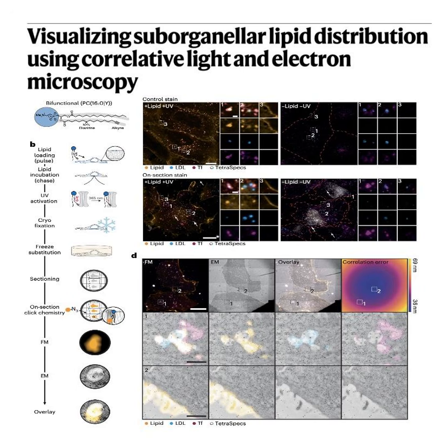Okay, so load. Crosslink. Next is F, freeze. Immediately after that 3-second pulse, they use high-pressure freezing. Cryofixation. And the total elapsed time for both the cross-linking and the freezing combined is roughly 10 seconds. And the brevity of that 10-second window is what makes this so revolutionary. 10 seconds is fast enough to trap highly transient membrane domains. Structures that only exist for seconds. Exactly, or minutes before the cell dissolves them.